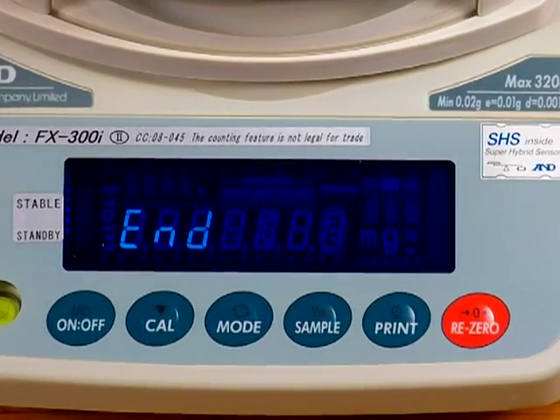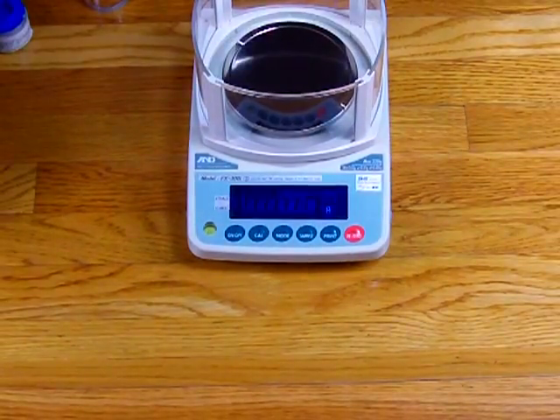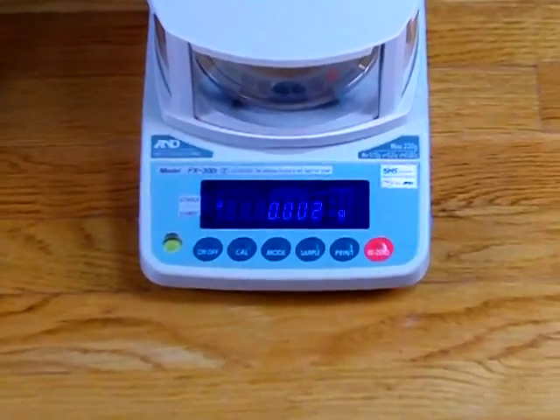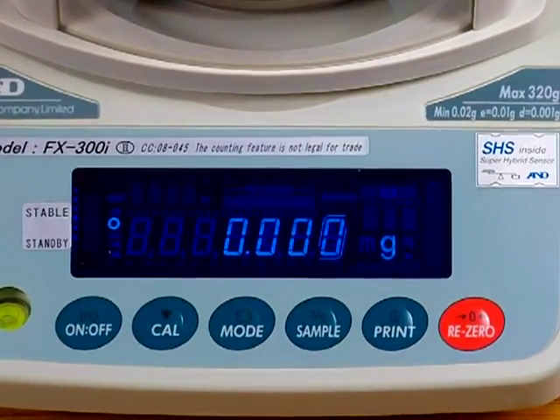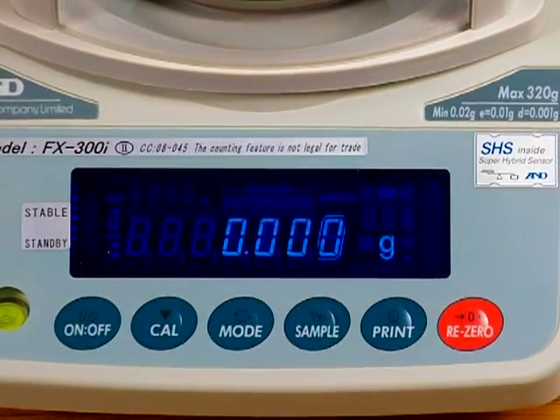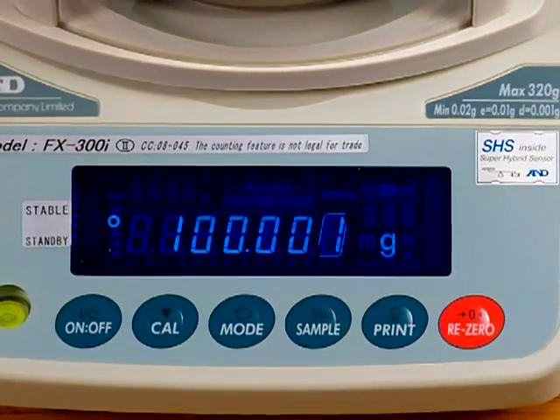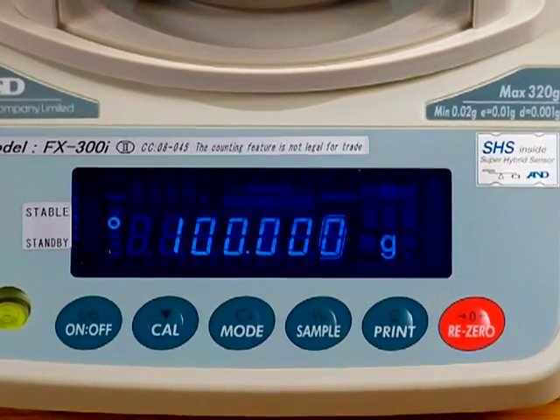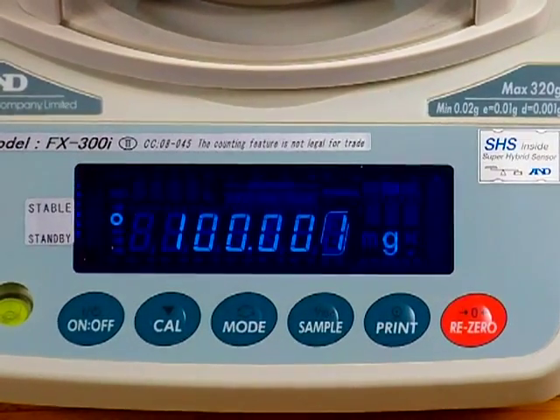It says 'N' now. Remove the 100 gram calibration weight — the balance returns to zero. We'll tare out the balance, place the weight back on, and there you go: your balance is calibrated. Again, this calibration procedure is for the A&D FXI series that is legal for trade.